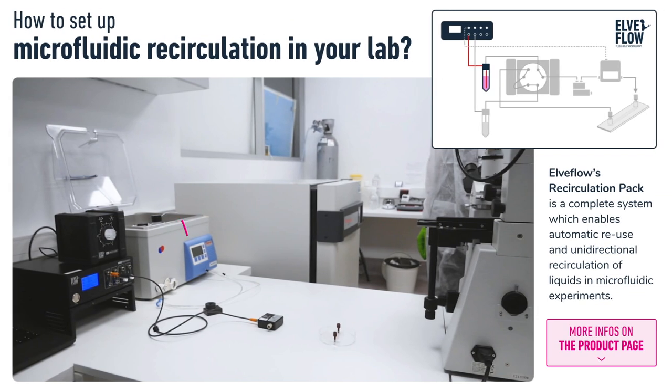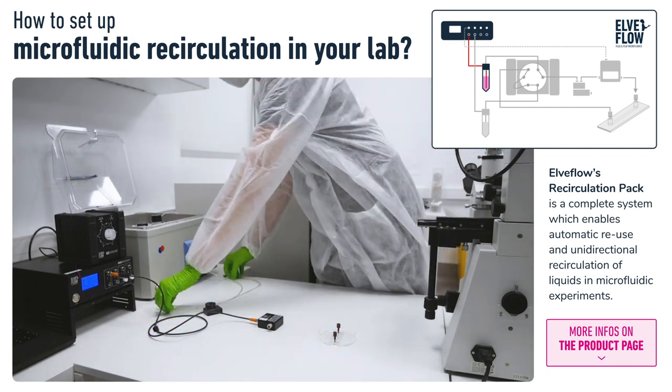Our workspace has the OB1 sitting on the table with a mux recirculation on top, and we have a heated water bath next to this to hold our liquid reservoirs at 37 degrees.